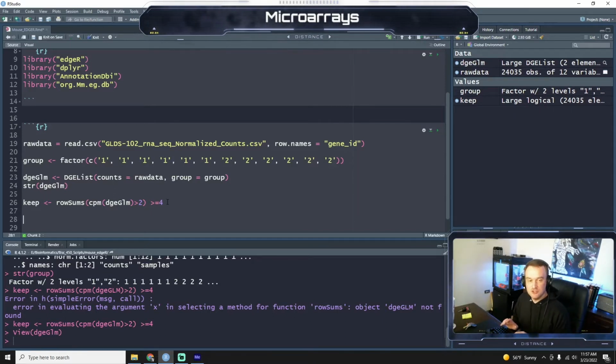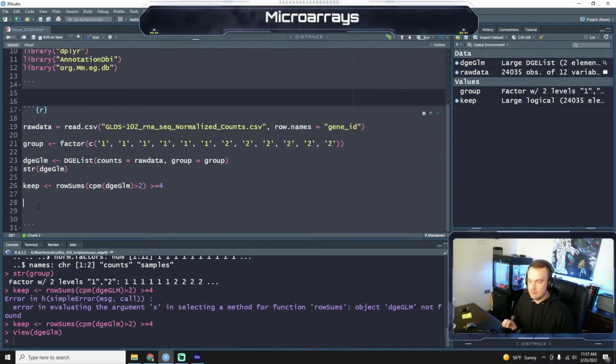You do that depending on how deep the sequencing is. You'll have really rare transcripts that you sometimes don't capture, and so this experiment must have had very good coverage, so we didn't end up having to throw anything out. Okay, so let's keep going.